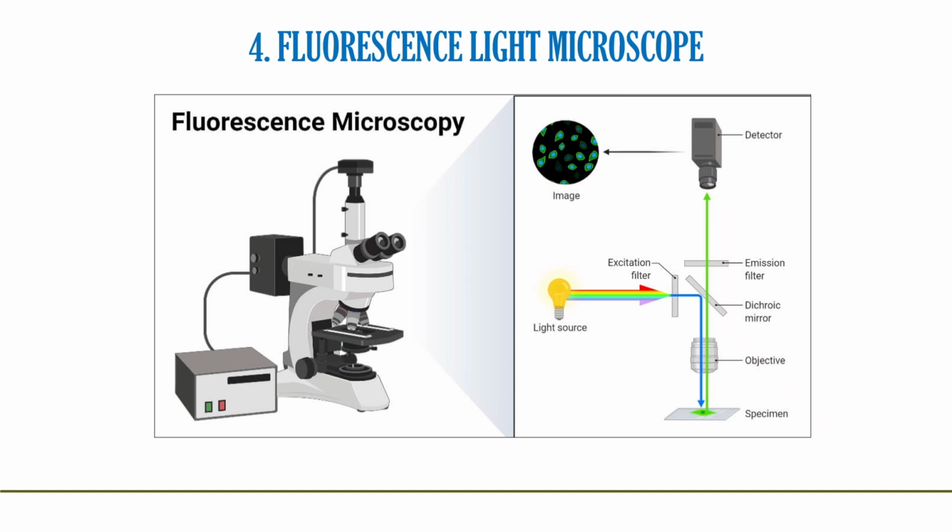Sample preparation. A sample of herring sperm stained with SYBR green in a cuvette illuminated by blue light in an epifluorescence microscope. The SYBR green in the sample binds to the herring sperm DNA and, once bound, fluoresces, giving off green light when illuminated by blue light. In order for a sample to be suitable for fluorescence microscopy, it must be fluorescent. There are several methods of creating a fluorescent sample. The main techniques are labeling with fluorescent stains, or, in the case of biological samples, expression of a fluorescent protein.